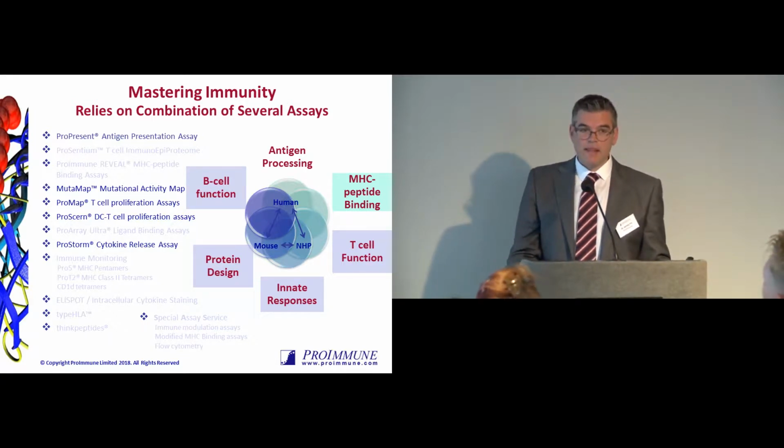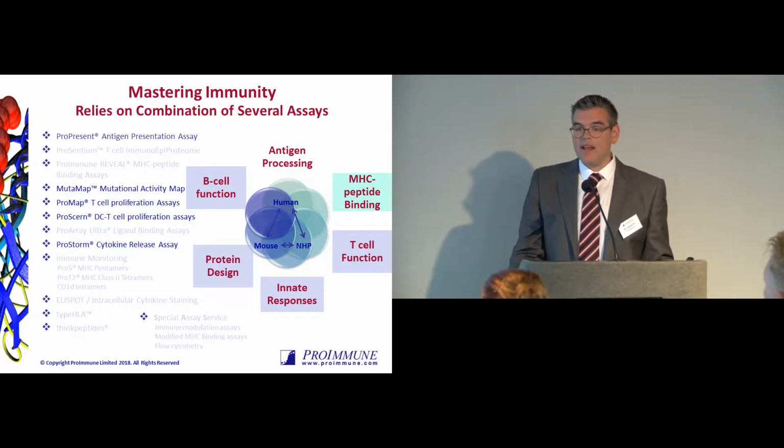Muta, which is going to come at the end of my talk, is a new technology involved in protein engineering, and how that can help address some of the big challenges with immunogenicity particularly. I'm going to talk about T-cell proliferation assays and dendritic cell T-cell assays and the parts that they can play in risk management approaches in development of different biotherapeutics, as well as pinpointing some very specific areas of maybe your immunotherapy, monoclonal antibody, for example, that is maybe driving some unwanted immune responses.